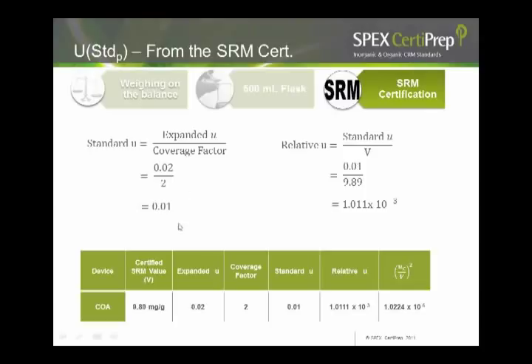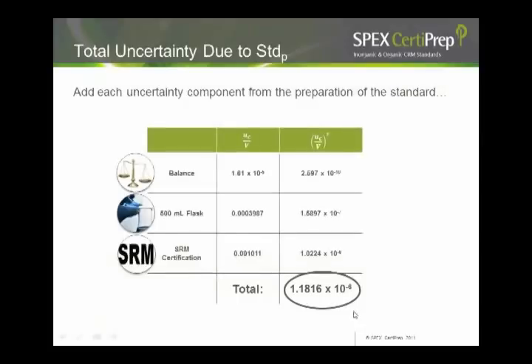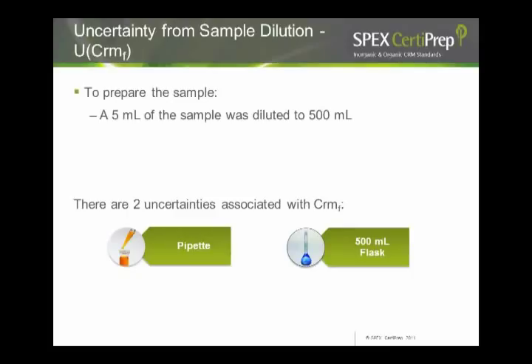Now I have used a tare weight and then used the gross weight in order to measure this 5.067 grams. So I have uncertainty twice the amount. So I listed it, I pooled it, and that value is given here. So what did we have now? In this table, we have the value, which is 5.067 grams, and the uncertainty that I combined and found for this balance. Now I have to calculate relative uncertainty, which is combined uncertainty divided by the value. This is what I'm going to use later to calculate my overall uncertainty.